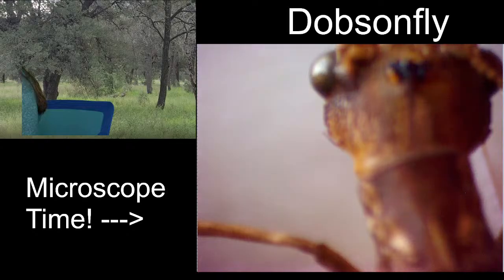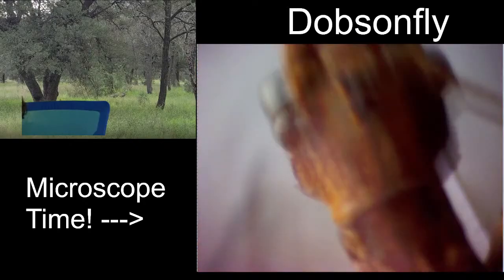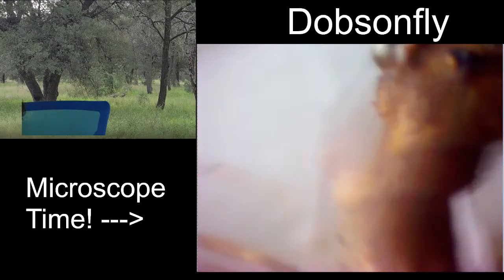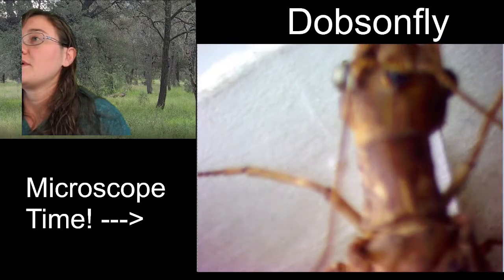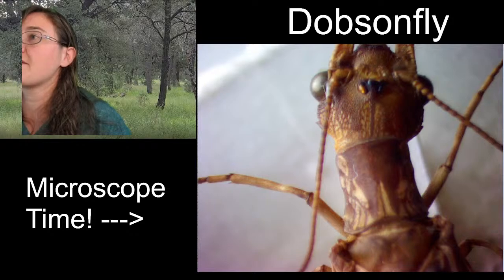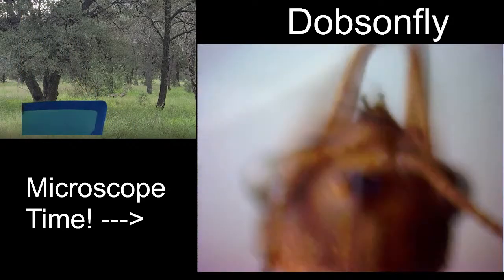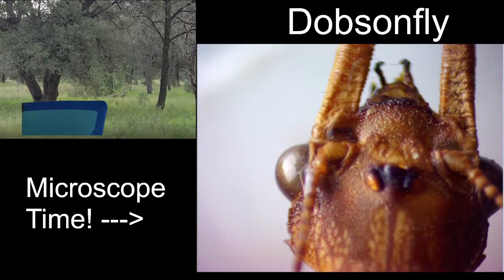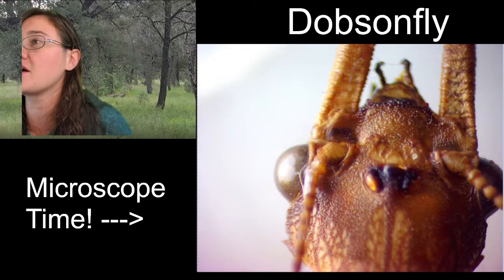Don't you want your antenna back? Here. Okay. Sorry about that little bit of drama. Really gotta watch out for those specimens there.